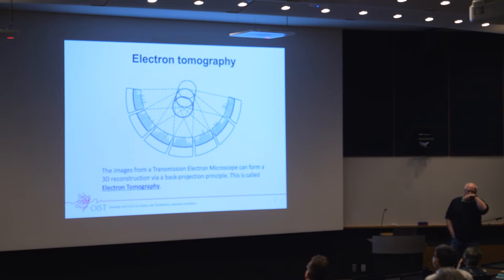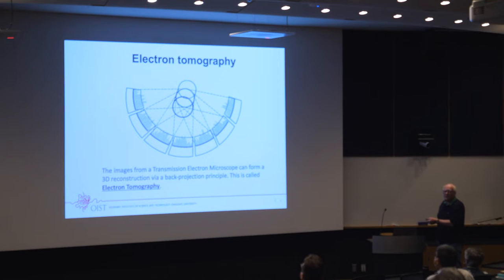So what is tomography? It's the same technique you use in older types of radar, and also in human reconstructions with CT scanners in hospitals. Basically, you have an object and you project a beam through it and record pictures like this. If you just record one slice, like a line on each photograph, you can fold that back with back projection mathematics, and you have one slice in there.